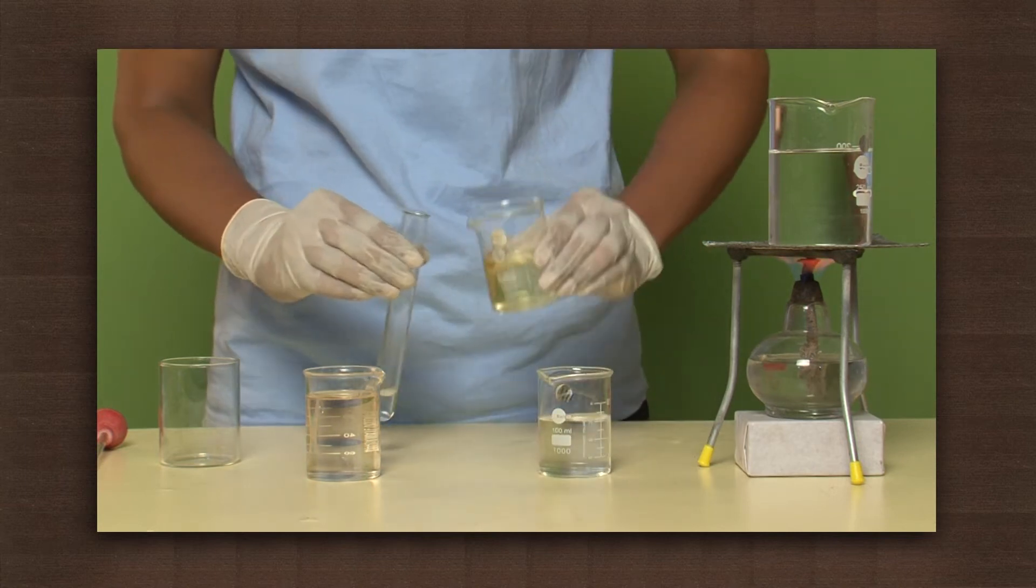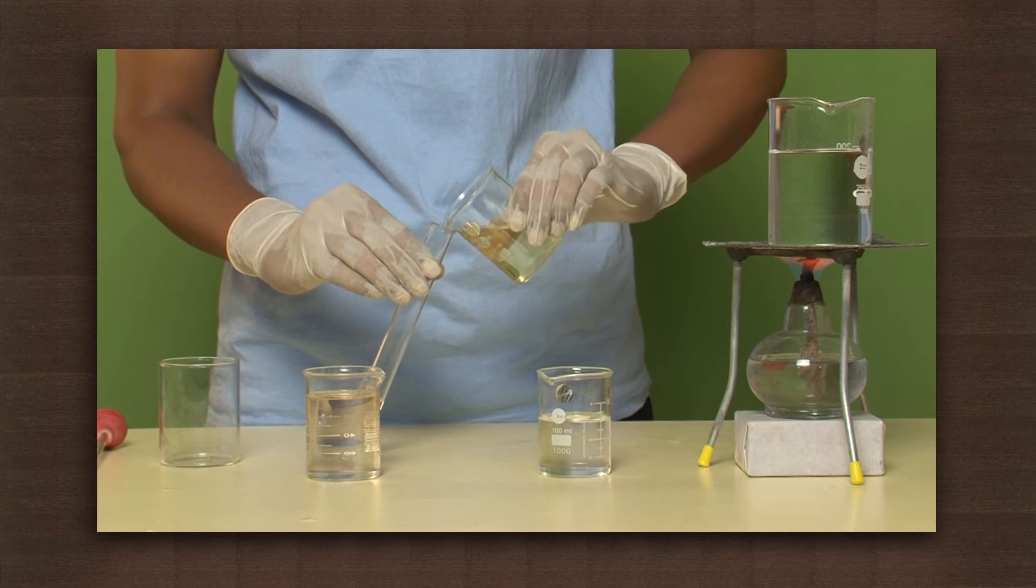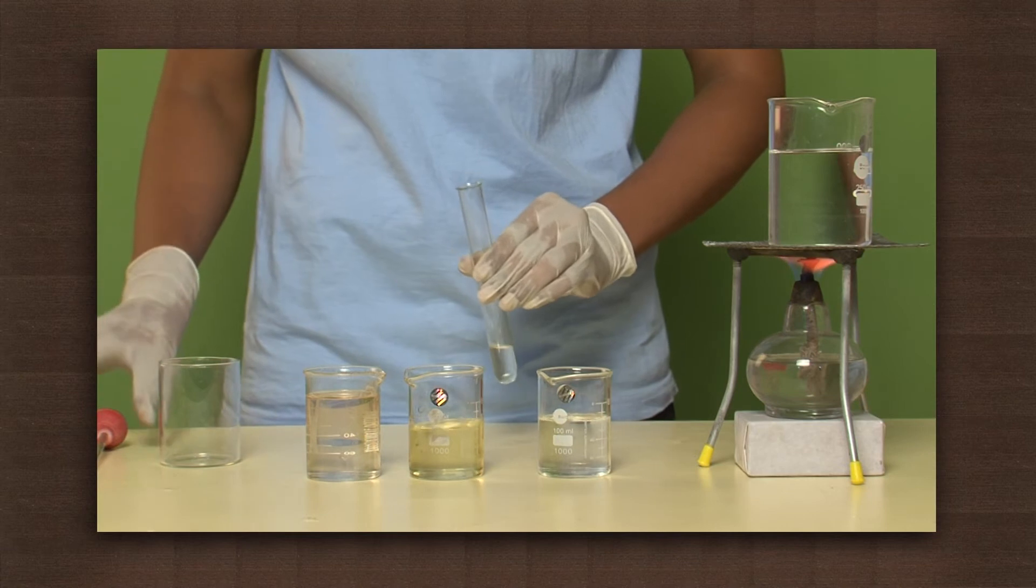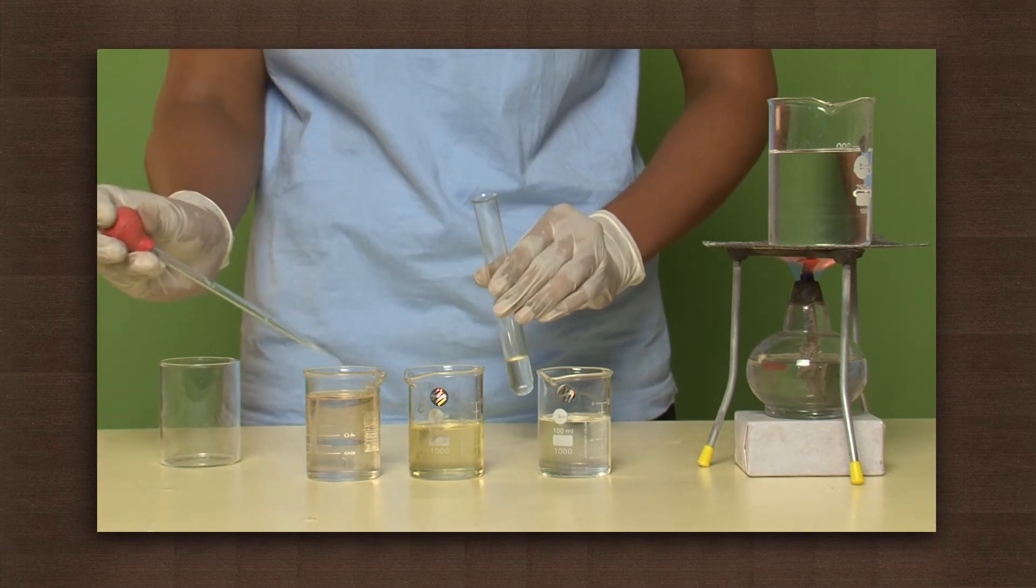In this test tube add some glacial acetic acid. Add a few drops of sulfuric acid.